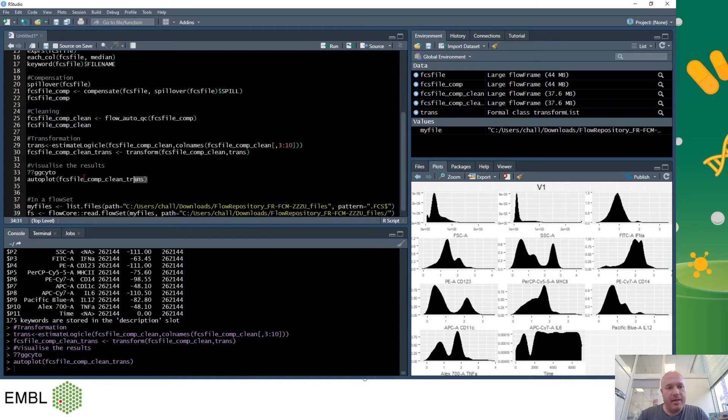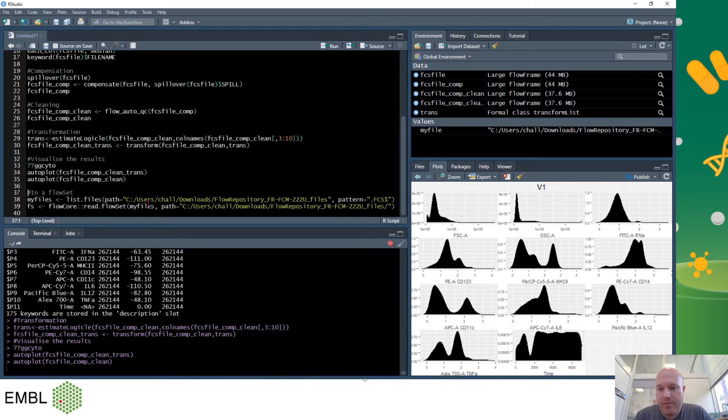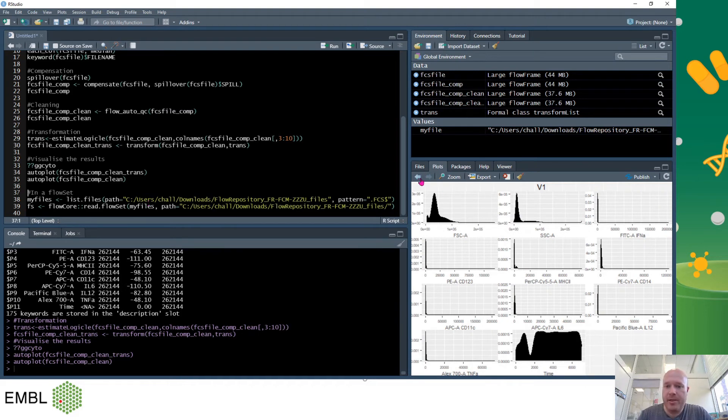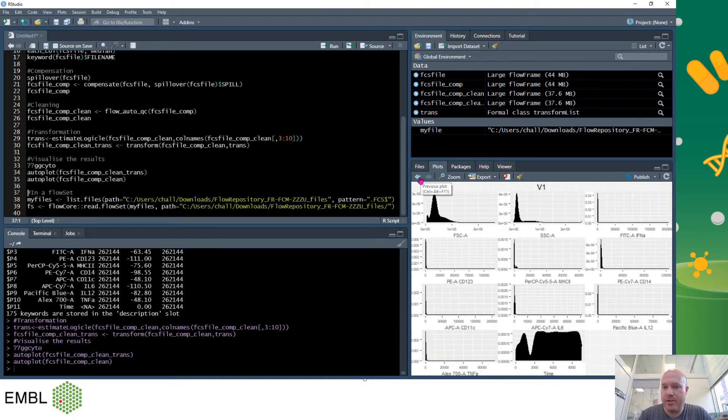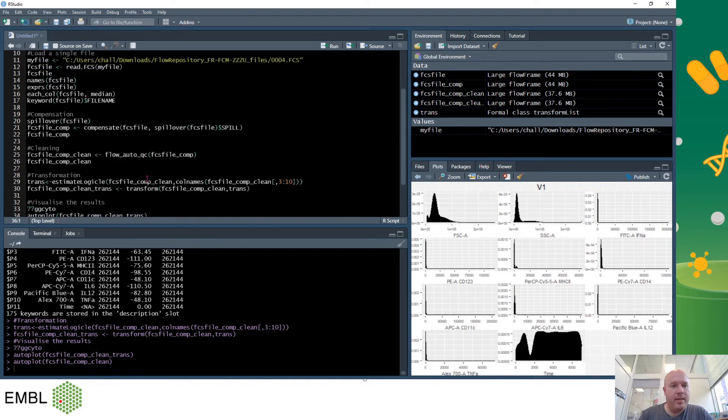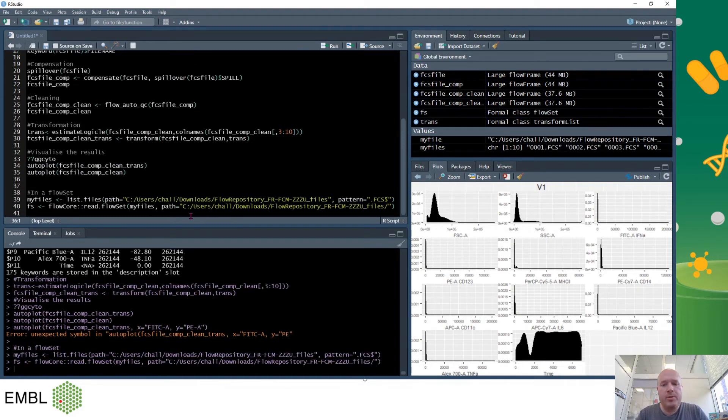I can do that again but instead of using the transformed data I can just use the clean data and we can see why it's so hard for humans to visualize changes in data when it's in the linear axis. On the plot window on the left we can use these arrows to go backwards and forwards and see the difference between the commands, the transformed and non-transformed. I can also export the data here.